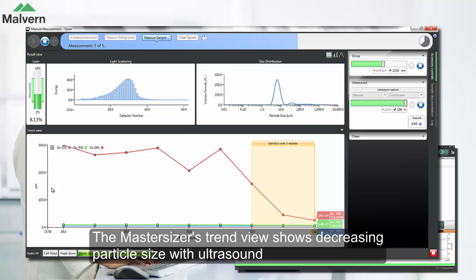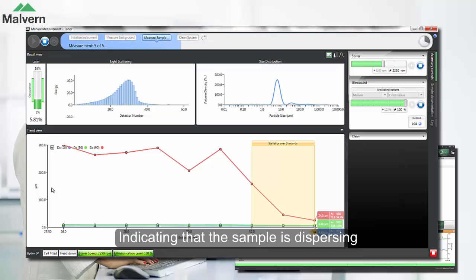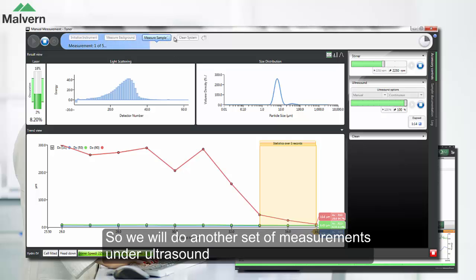In the MasterSizer software, the trend plot shows us that the particle size is decreasing with ultrasound, indicating the sample is dispersing. However, the sample is not fully dispersed, so we'll leave the ultrasound on and start another set of measurements on the MasterSizer.